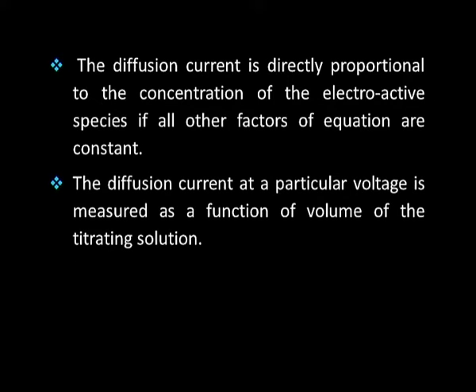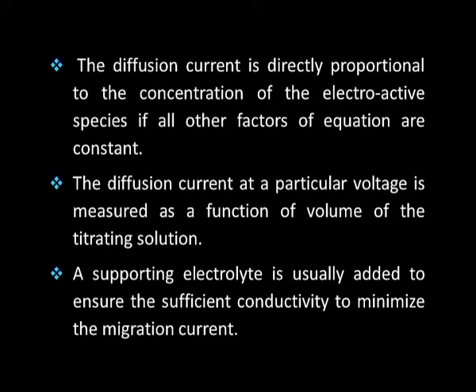The diffusion current at a particular voltage is measured as a function of volume of the titrating solution. A supporting electrolyte is usually added to ensure sufficient conductivity and to minimize the migration current.